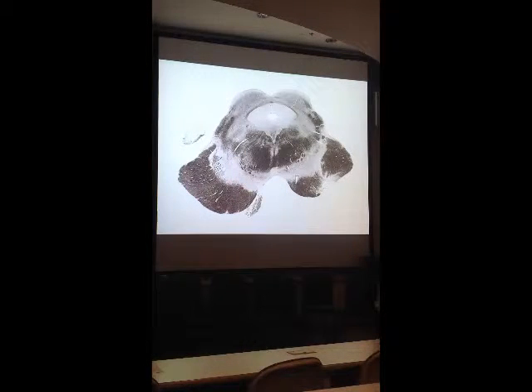You should be able to identify the structure as the cerebral what? The cerebral peduncle, or crus cerebri. Again, I'm not as likely to ask you what kind of fibers fill the middle third. You already know that. That's pyramidal fibers. Here, corticopontine. But remember, there are other descending cortical fibers mixed in the cerebral peduncle besides those fibers that I mentioned.